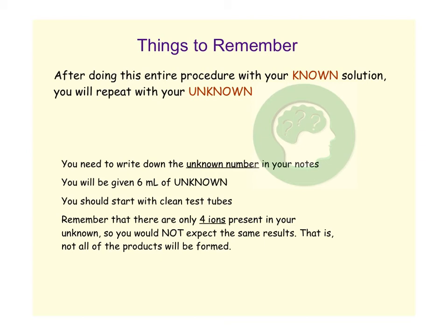Always clean those test tubes really good because you don't want any of the remnants of the other ions in them. And then you're not showing your teacher every step this time. So wait till the very end and then tell the teacher what 4 ions you found.